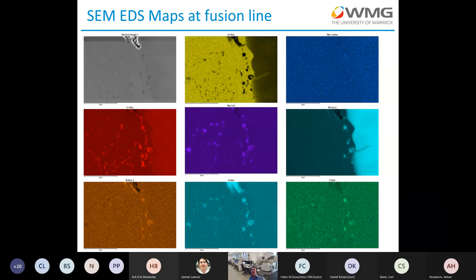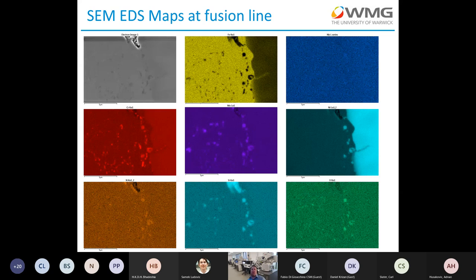Using SEM EDS, at the fusion line the relatively coarse particles contain mainly nickel, molybdenum, chromium, vanadium, and silicon — a different chemistry from the fine particles further from the fusion line, which have compositions consistent with M23C6 and Laves phase. The benefit of looking in the SEM is that it's fairly easy to check if we're getting the same basic composition of particles as we move up and down the fusion line. However, unambiguously identifying a phase based on SEM EDS maps is not straightforward, especially when using low kV to get the spatial resolution needed to see these particles clearly.